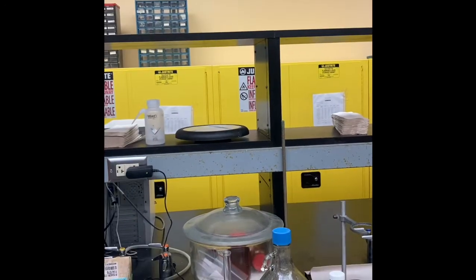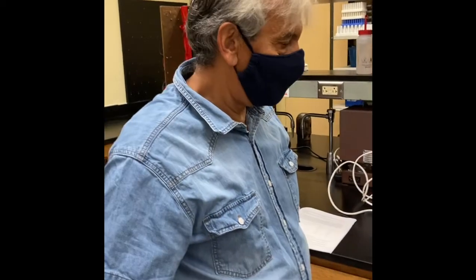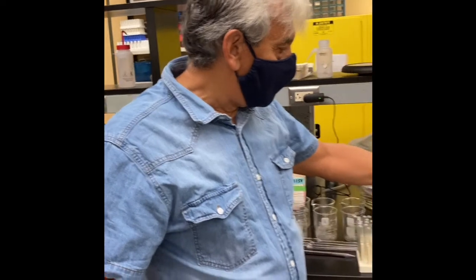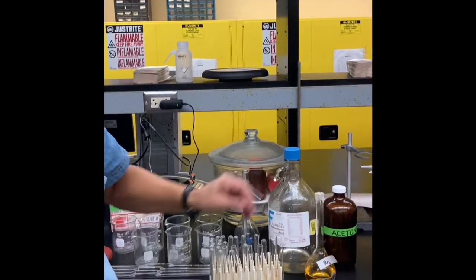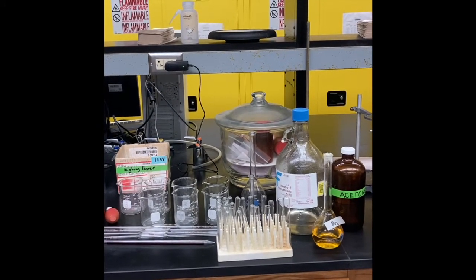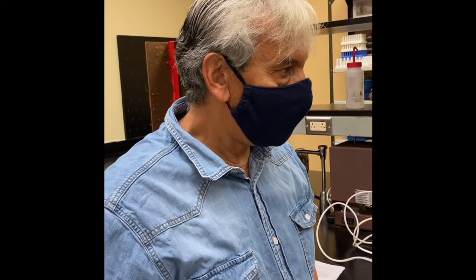Therefore, we can follow the reaction progress using UV-visible spectroscopy. The characteristic wavelength at which bromine solution absorbs light is 400 nanometers. So the larger the concentration of bromine, the larger the absorbance at 400 nanometers, according to the Beer-Lambert law.